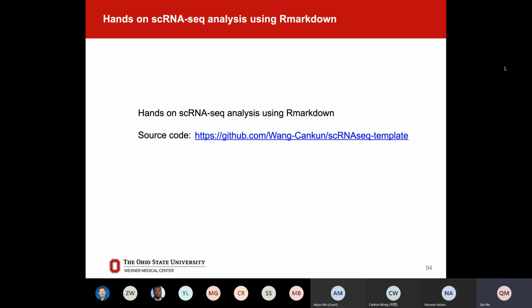So I as a user am just testing the whole thing, and I'm stopping here for questions. Any question in using Rmarkdown, in repeating what I just showed? Please feel free to ask. Both Cankun and I are here to answer questions. Is there any? Okay. It seems everybody can access this code and file, and I hope you enjoy it.